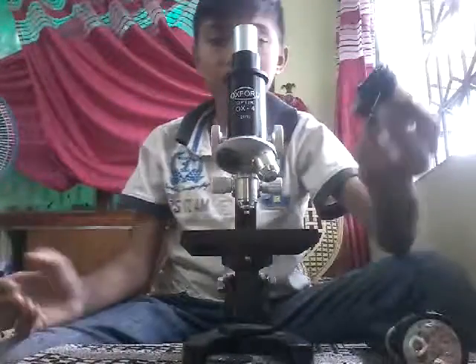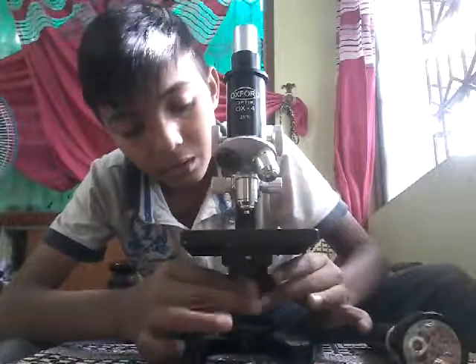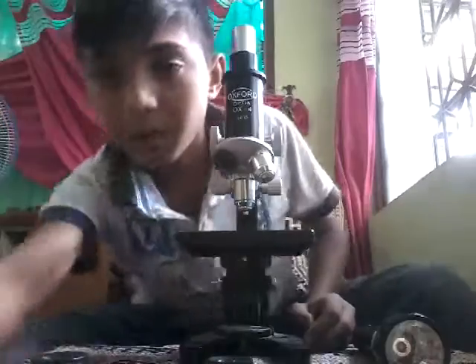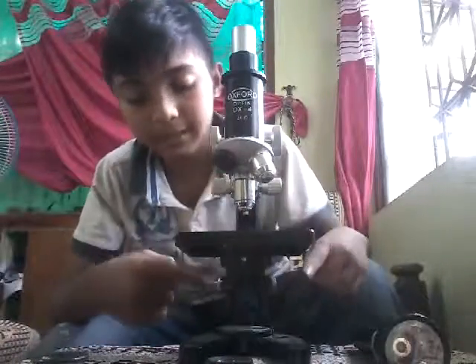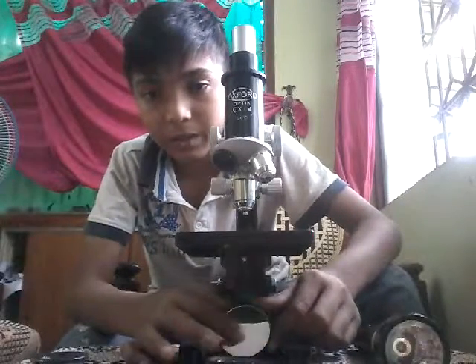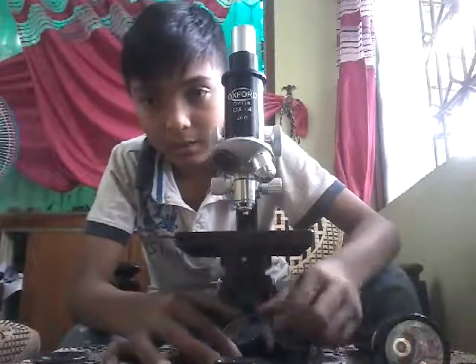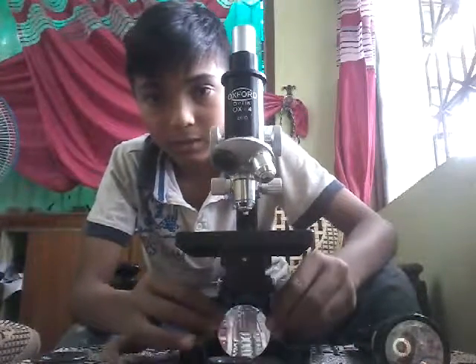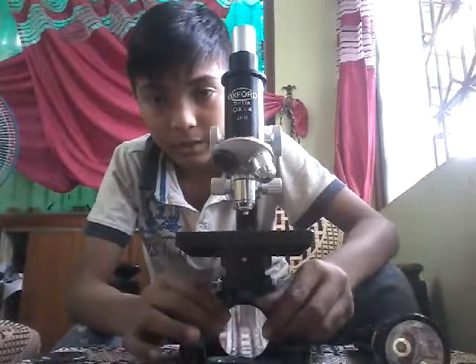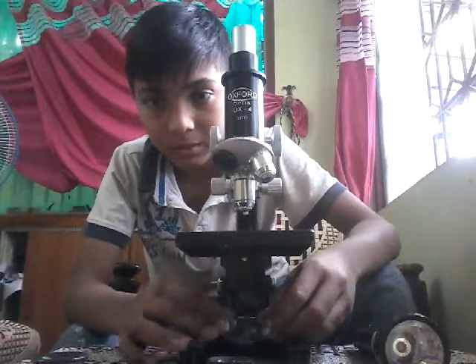Okay, now let's fit it, guys, from below. Fit it and throw on it. Okay, I'll fit it. One more thing, guys, it's a compound microscope, and here is for the light. This is a mirror here for the light to pass. See, guys, it is for the light. See, guys, you can see the camera. You can see me also.